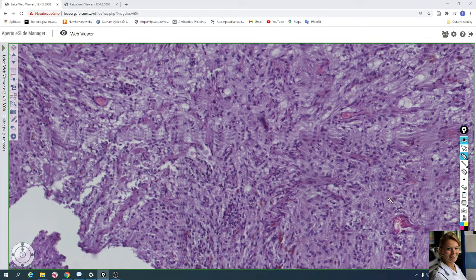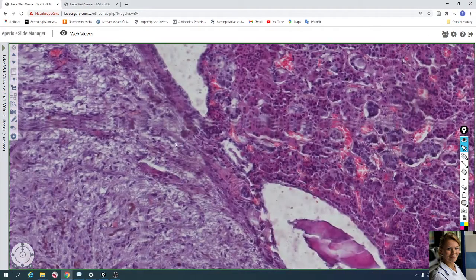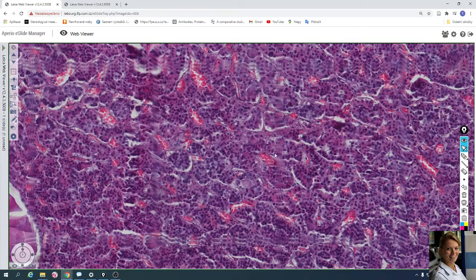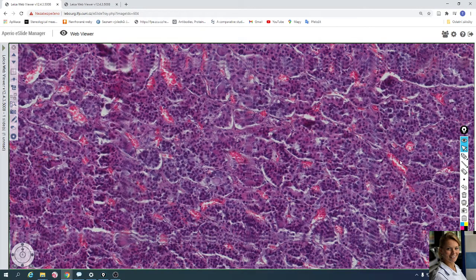Of course, the anterior lobe also contains many blood vessels. Here are capillaries with erythrocytes inside the lumen, for transporting released hormones to the bloodstream.